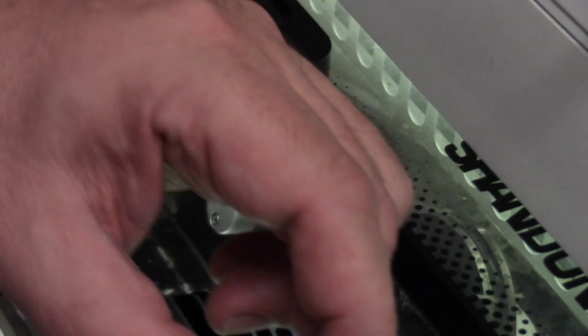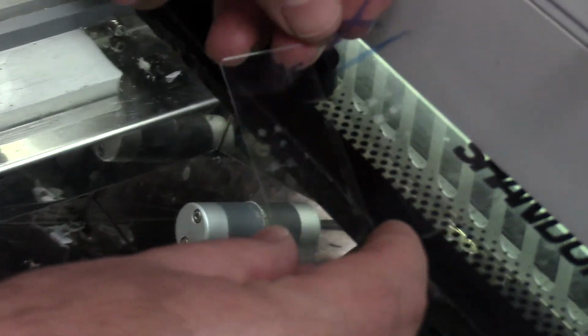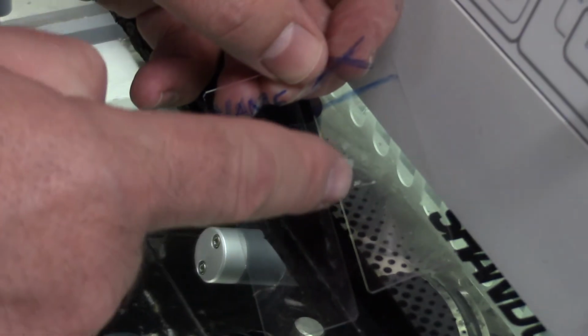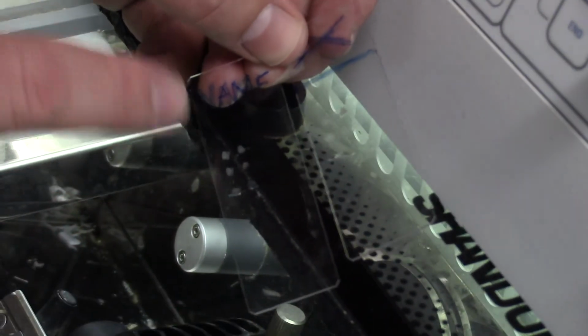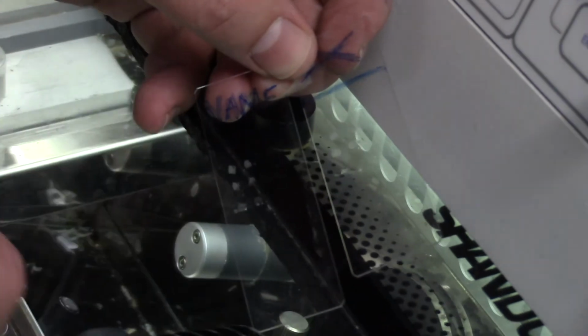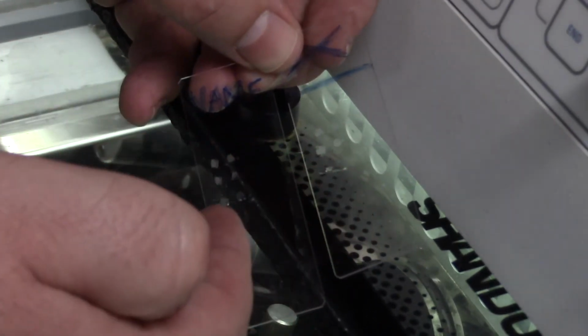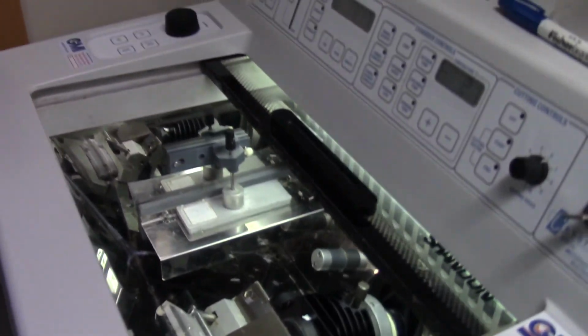Perfect. So now when I'm comparing these and I put them under the microscope, if I'm on this slide, I'll go, good section, good section. Oh, there's some garbage, but I can still tell that there was tissue there, and I'll just keep going to the next section. On this one, I'll have 3 good sections to compare to the 2 sections that are here. But I'll put the next section here, and I'll fill these slides up until they look like a number of other ones that I've done here.